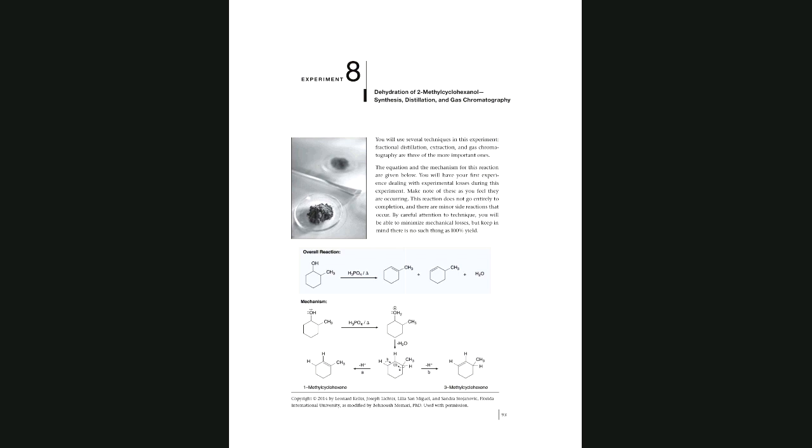Why are we using distillation in this case to separate the product? Can anyone answer that question for me? We distill the product, right? Basically, you have your reactant, you have your reagent, and you have your product. When you have the product, you are distilling that product. Basically, you are separating it from the reactant using distillation. Does it make sense to use distillation?